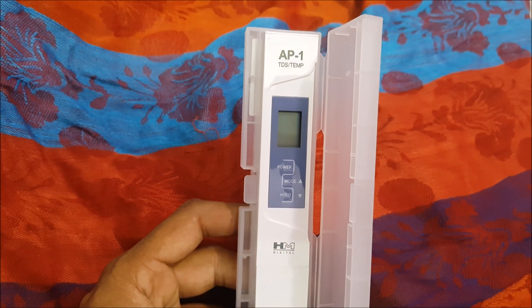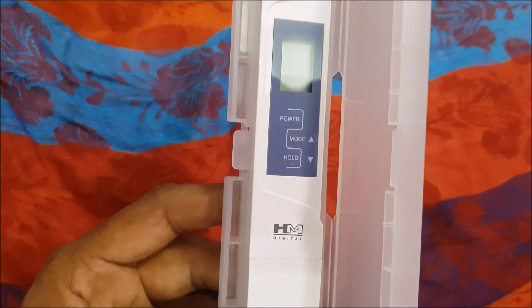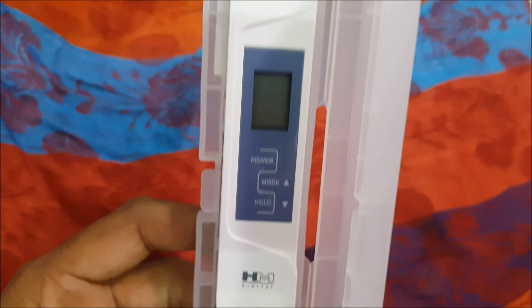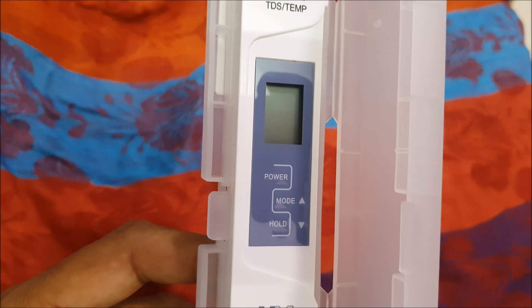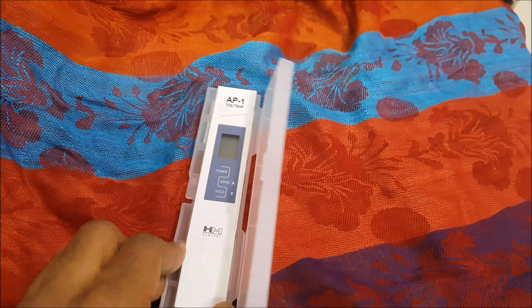On Amazon it's listed as a generic TDS meter, but as we can see here it's an HM Digital one. The model is AP1, and it gives both a TDS reading as well as a temperature indication.